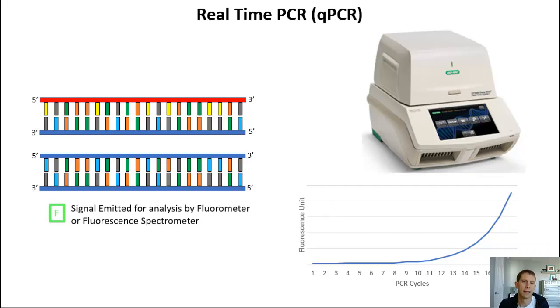So that is exactly how our RT-PCR testing for COVID-19 works that's performed all over the nation right now. We are detecting the fluorescence signal emitted, so really all we have to do is put our sample in the vial, add in our TaqMan probe, our triphosphate units, and our Taq polymerase, as well as our buffer, allow this to go, and the reading of the fluorescence unit, if it expands, there are some additional calculations related to this, but it's pretty much this simple.